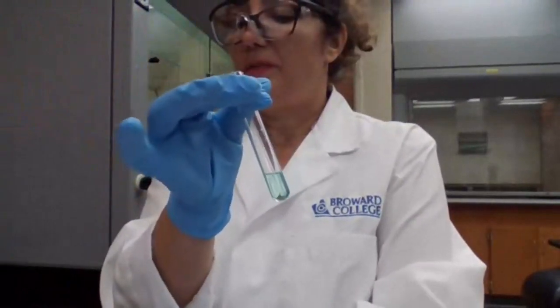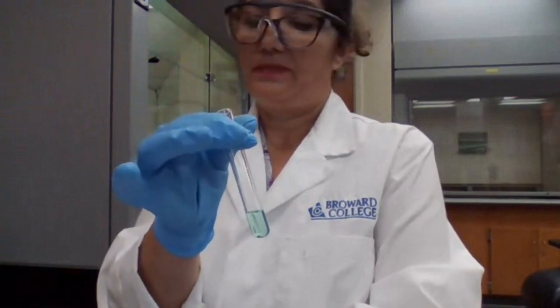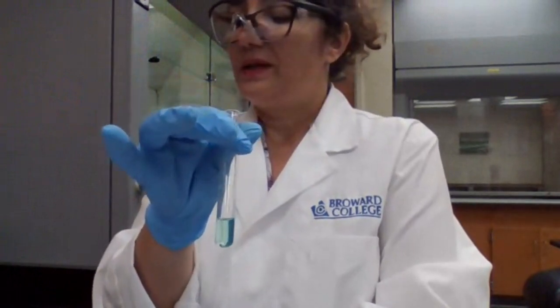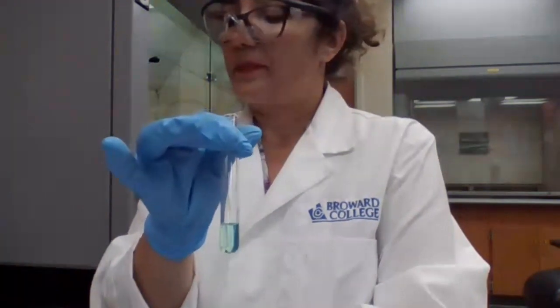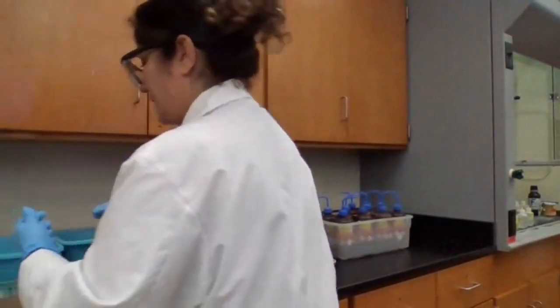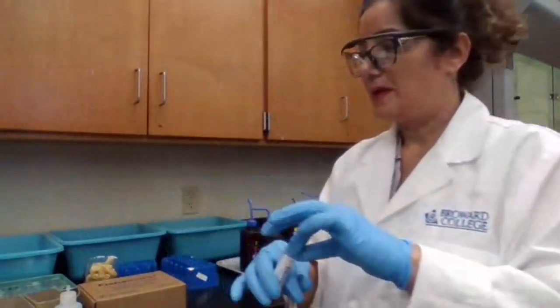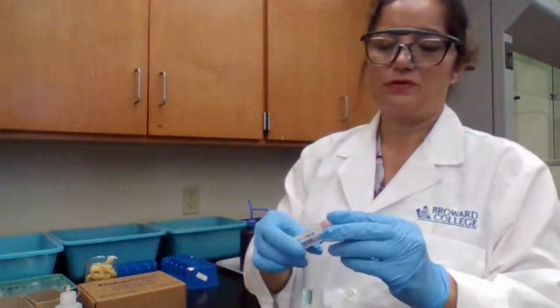Now we are moving to part 2B, where we want to separate the bismuth hydroxide. To do that, we add ammonia until the solution is basic to litmus paper. I have to make sure I have litmus paper here. Yes, we do. If the solution is basic, it will change red litmus paper to blue.